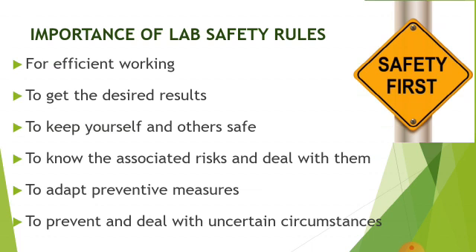Importance of lab safety rules. Lab safety rules are meant for efficient working, because when the rules are followed, the working goes on smoothly and experiments can be performed very easily. They help to get the desired results, to keep yourself and others safe, to know the associated risks and deal with them, to adopt preventive measures, and to prevent and deal with uncertain circumstances.